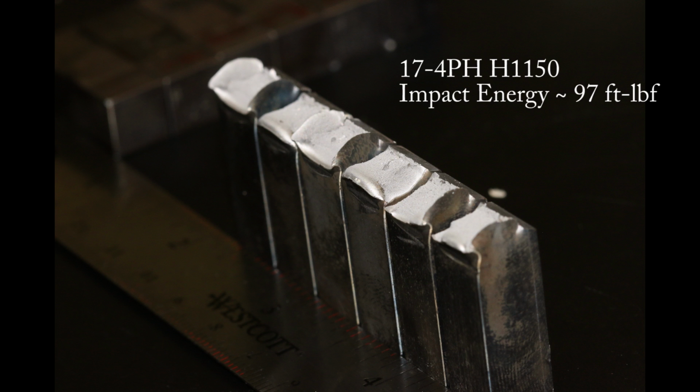And as far as the samples go, if we listen to the clip, we can hear that once again the sound that the impact makes is much deeper than either the H1025 or H900 conditions. And likewise, if we look at the fracture surfaces of the sample, the shear lips are much larger than either of the two previous samples, indicating once again that there's more deformation and more energy absorption in these samples.